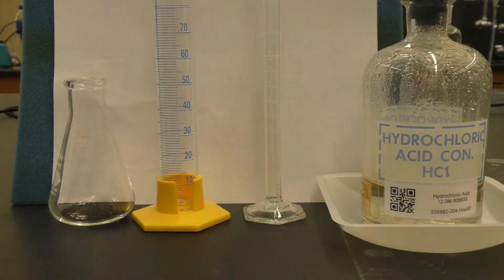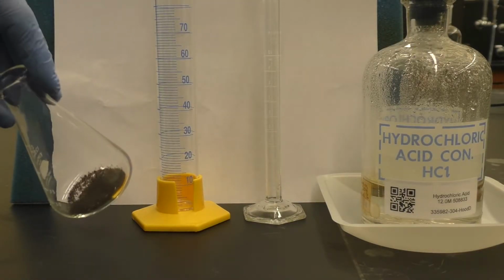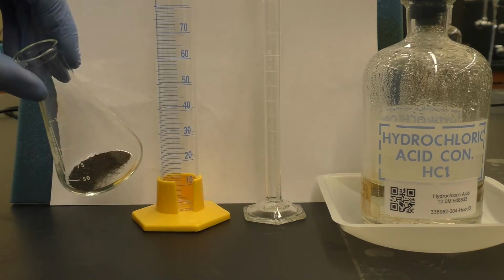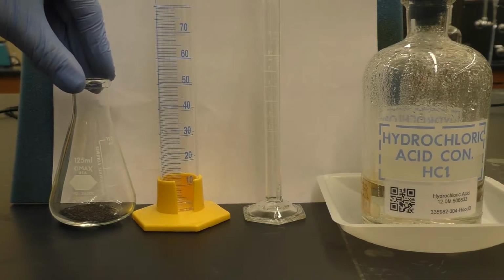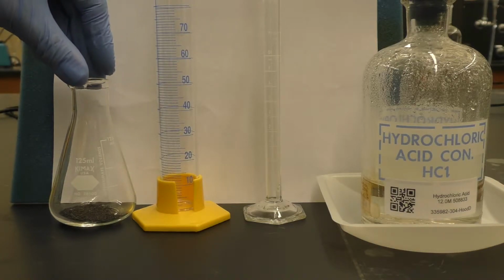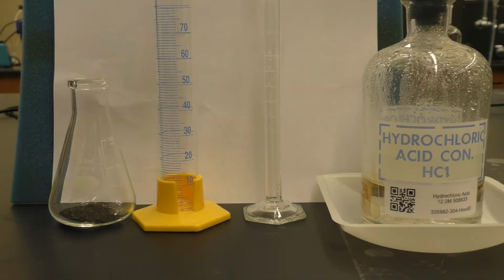So now that we've weighed out our 4-aminophenol and put it into this 125 milliliter Erlenmeyer flask, I'll now measure out 35 milliliters of distilled water and add that in, and then 1.5 milliliters of hydrochloric acid. And we'll swirl that together, try to make sure we can get the amine fully dissolved.